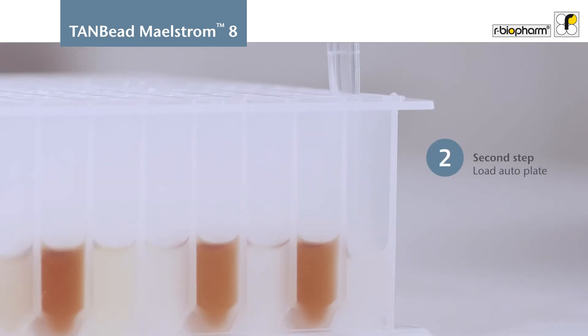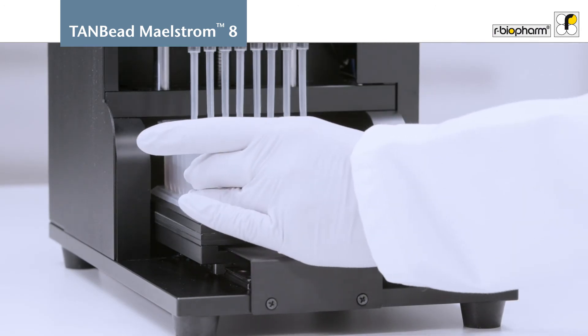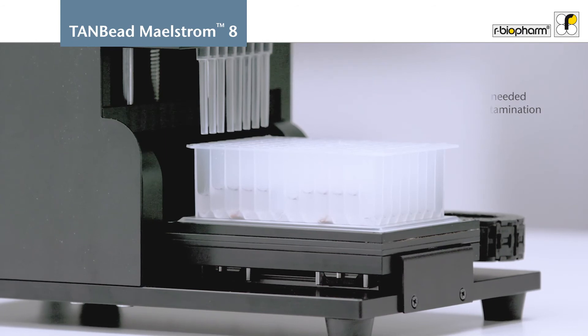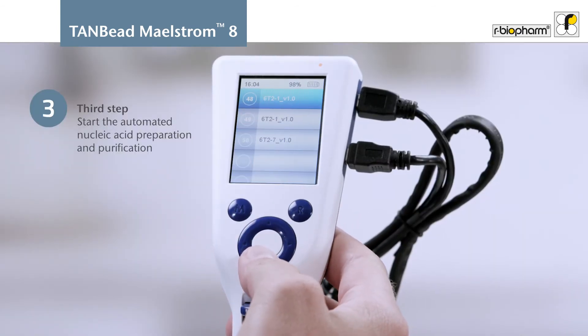Next, transfer the lysate into the auto plate and insert the plate into the M8 AutoStage. The sealed auto plate is already pre-filled with all necessary reagents, minimizing the risk of contamination. Now select the protocol, start the extraction and walk away.